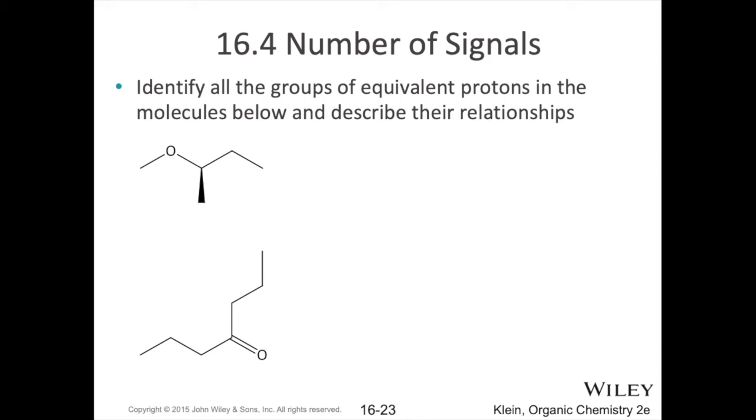All right, so let's practice that. Have a look at these two molecules here. Look at all of the protons and ask yourself, how many different groups of equivalent protons are we going to see? In other words, how many signals are we going to see?